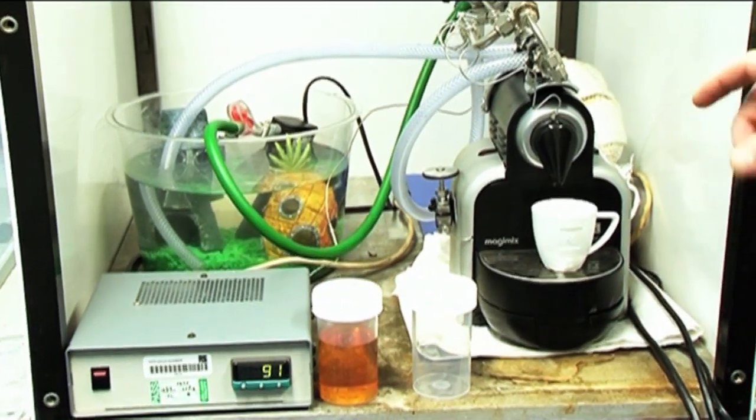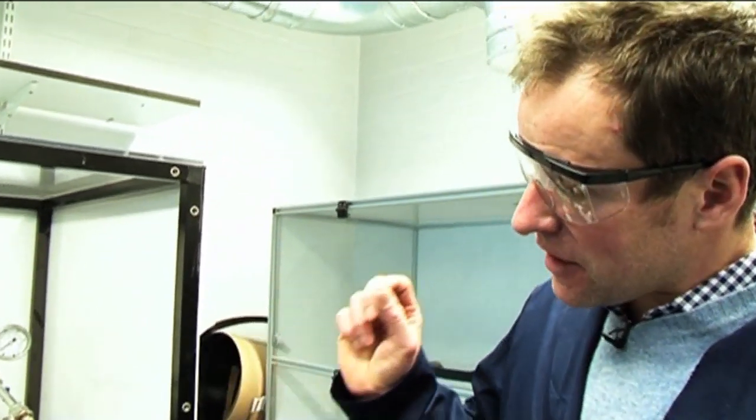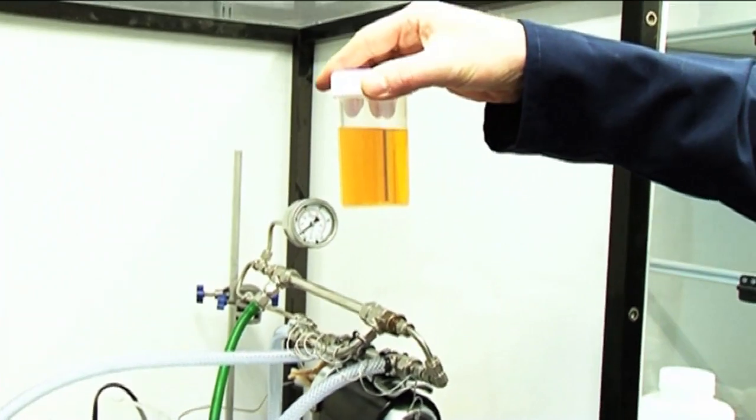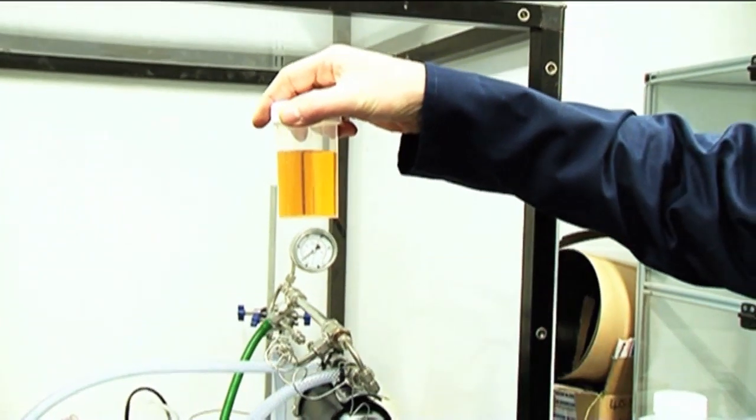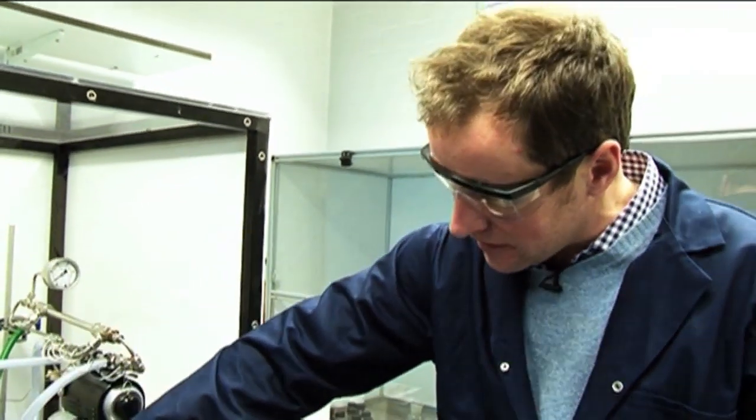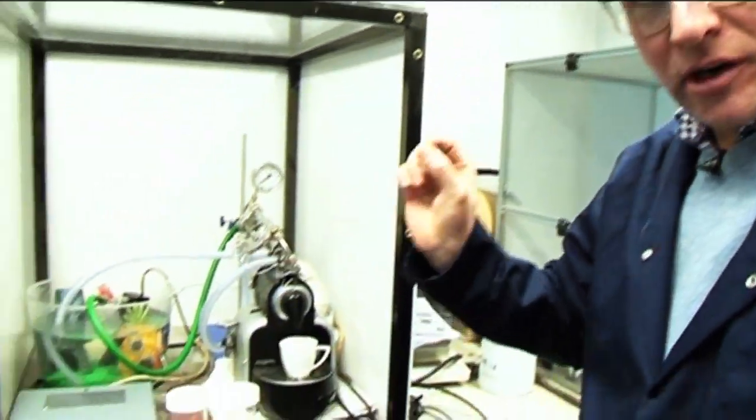Effectively, it's taking water that's got metal ions dissolved in it. And if they go through sufficient pressure and temperature, those metal ions combine to form a particle. And those particles are nanoscale. So they may only have 100 or 1,000 atoms in them. They're really, really small, very high surface area. That's the precursor that goes in, the metal ions dissolved in water. When that passes through this reactor, it'll come out the other end with a different color because we've got particles inside.